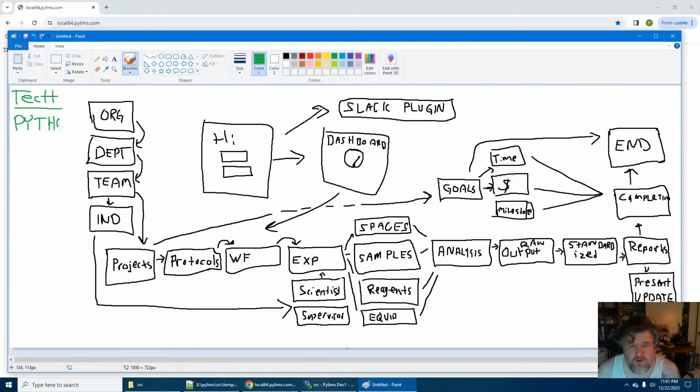That's not true, not all the backend will be in Python, which we're going to be using Django. Oh no. And that's pretty much it. We'll also be running some web sockets, which are fun.